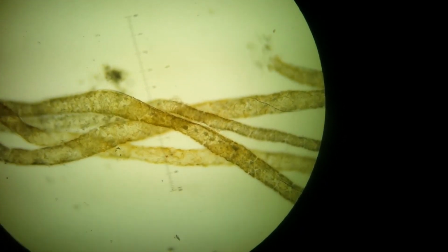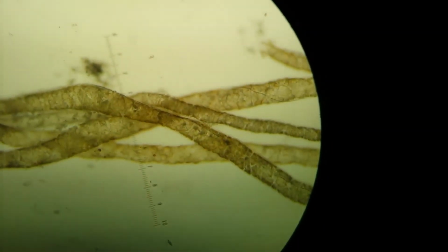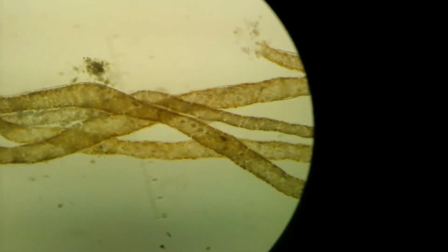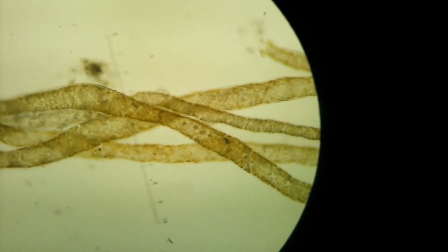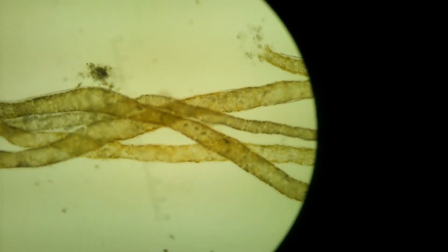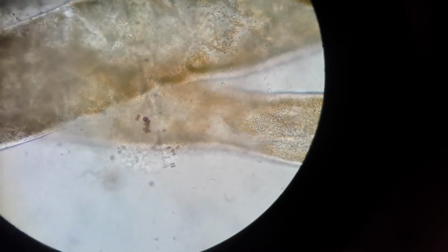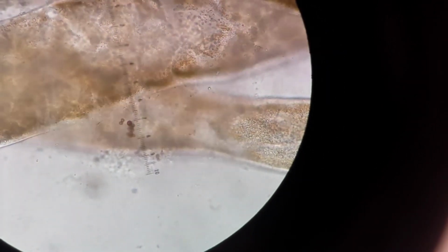Great stuff. Alright, if you now look at the lowest Malpighian tubule, you can see some red granules of that red amaranth dye. They're not coming into focus fantastically well, but they're there. We'll try and take a closer look at those. Okay, trying to take a closer look here. It's a little challenging because at a higher magnification, we're up to the 40x objective. We don't have as much depth of field, and I can't hold the camera and focus at the same time.